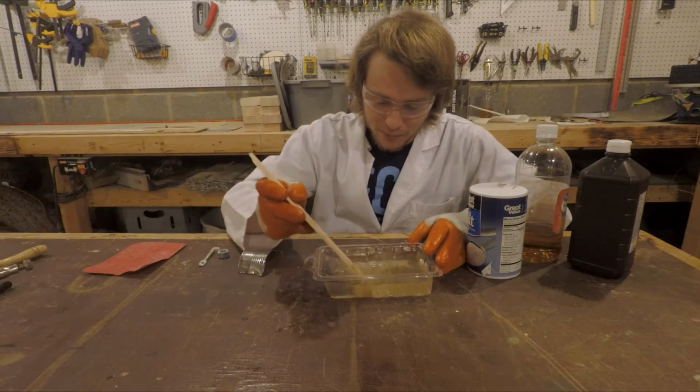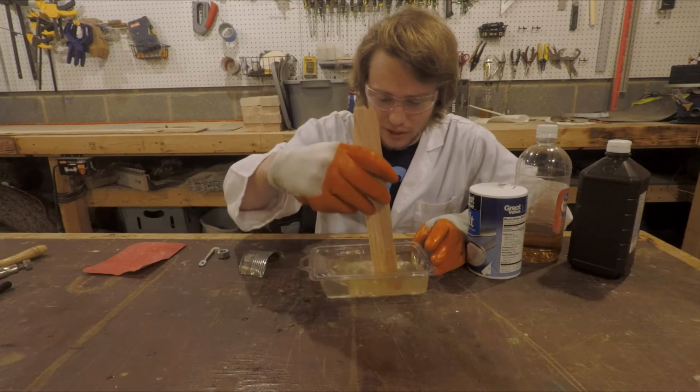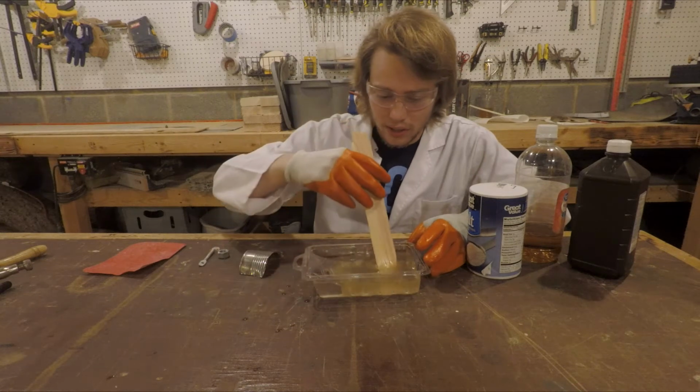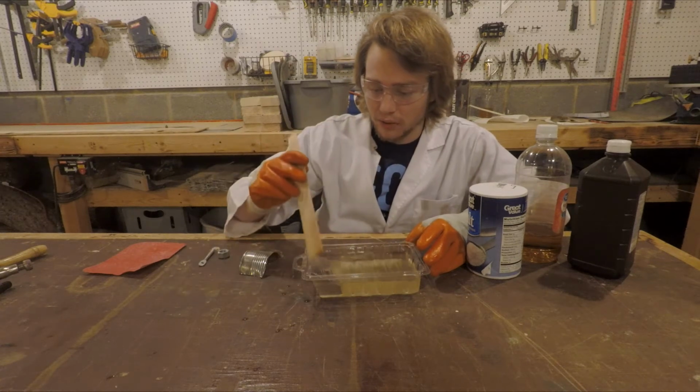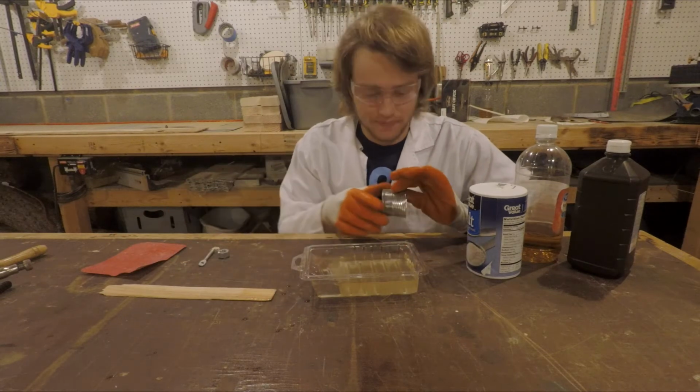Now that you have your gloves on, feel free to mix up the liquid we have here. And once we get it to a good amount, it should be pretty much ready to go. So all we have to do is take our metal and throw them into the bath.